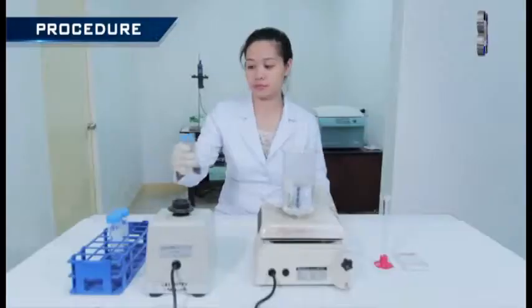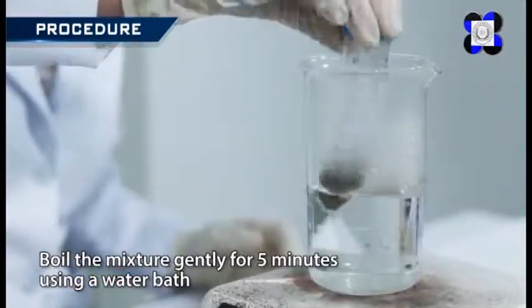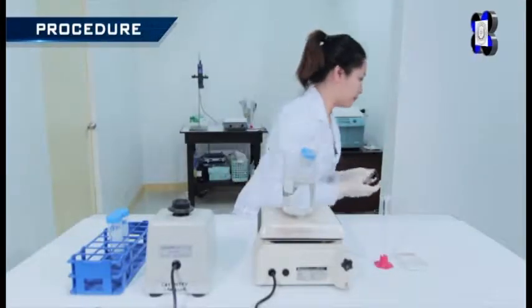When the desired pH is achieved, boil the mixture gently for 5 minutes using a water bath. Make sure the cap of the conical tube is loosened.